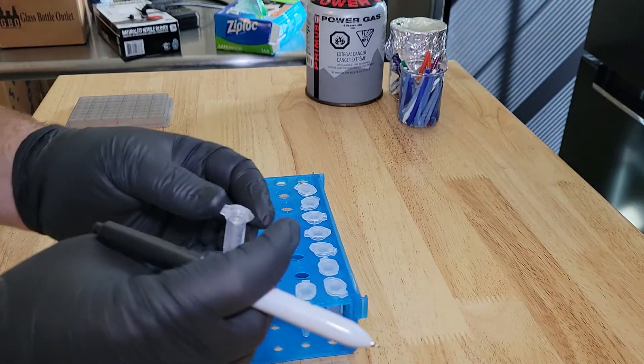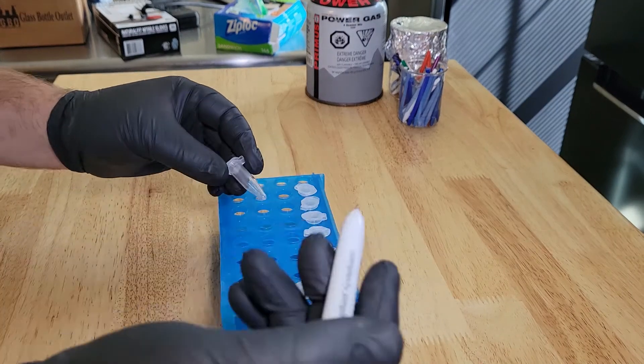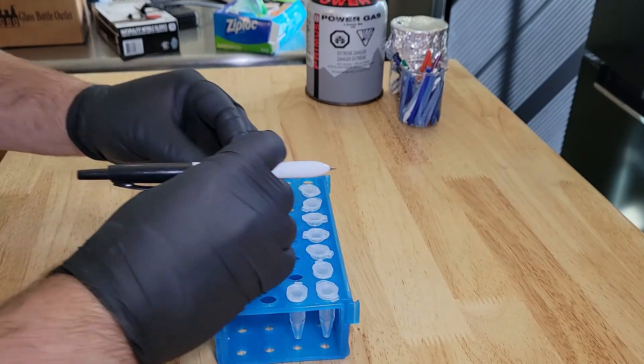You're going to want nine microcentrifuge tubes. Label them with the number and the date.